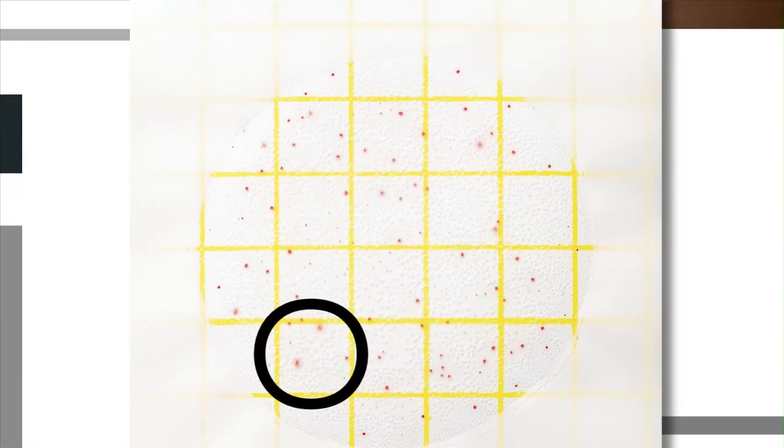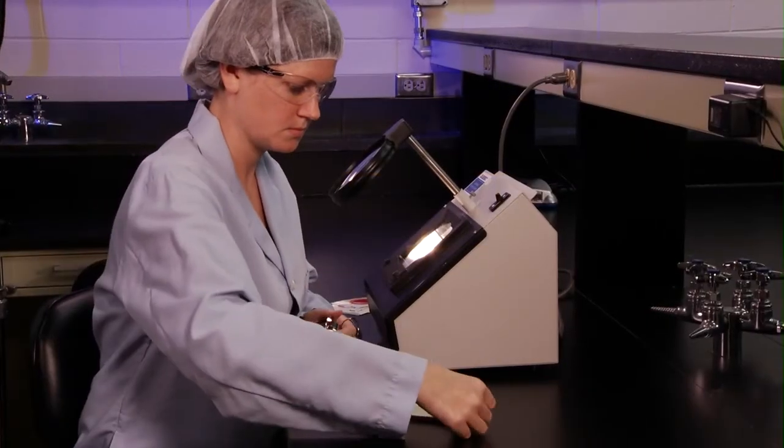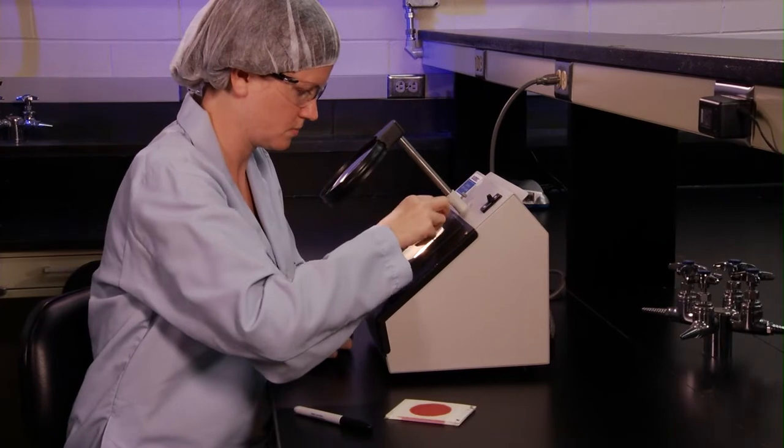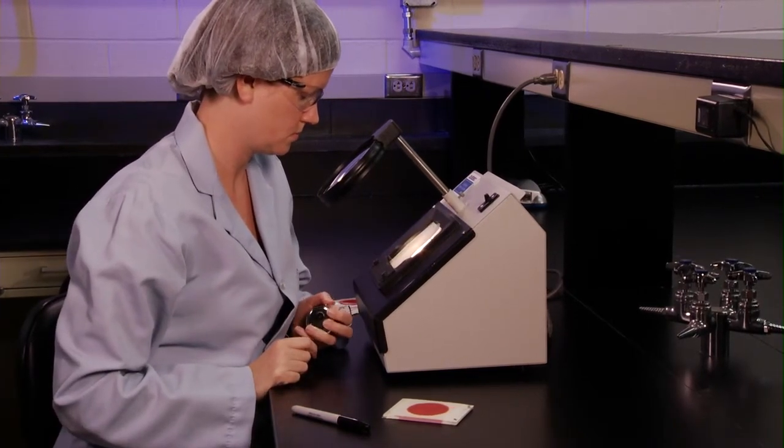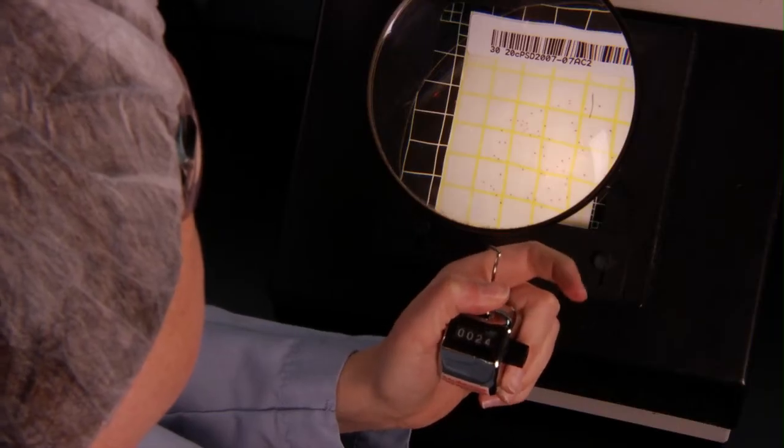All colonies should be counted, regardless of size or color intensity. Good lighting is necessary for accurate counting. An illuminated magnifier and a hand tally may help for counting bacterial colonies.